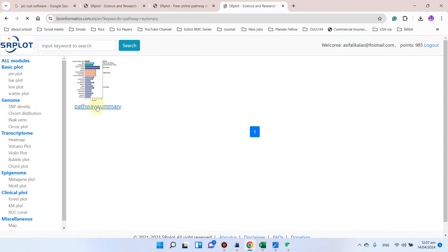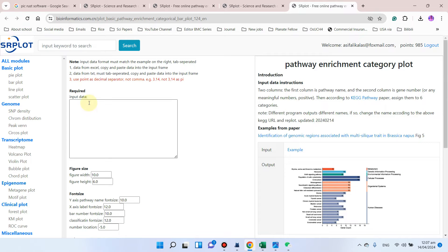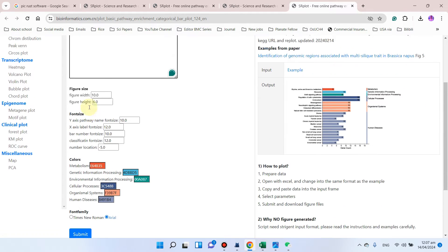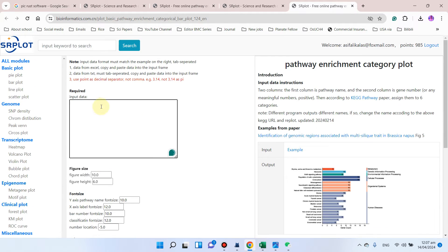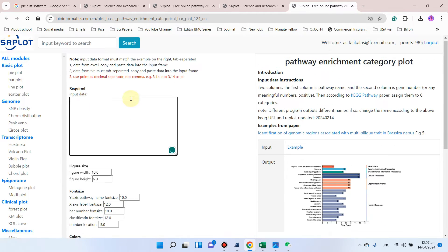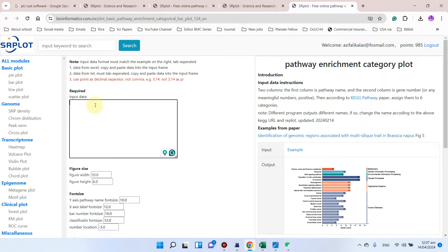Here you can see the pathway summary plot. You can click on this one and here you can input your data. Let me show you how you can prepare your file for inputting this data.